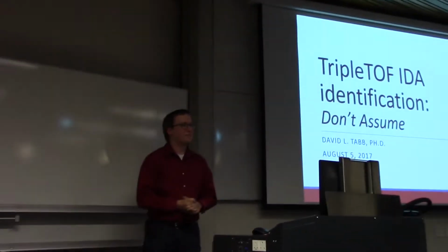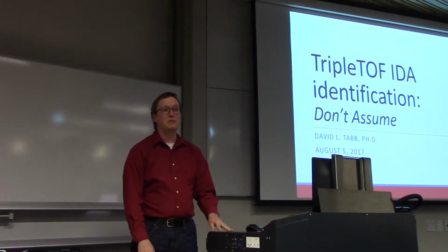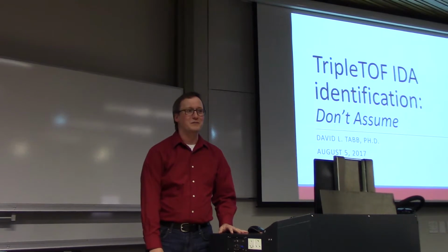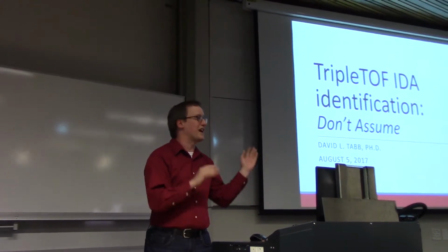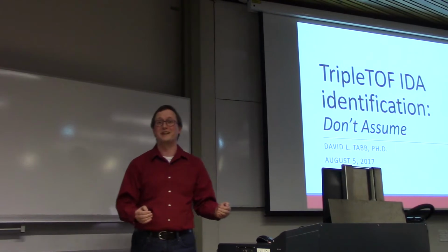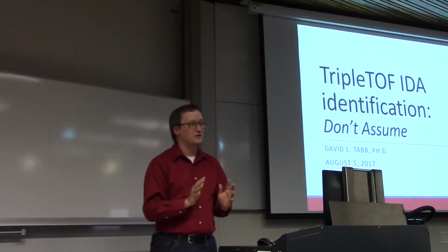Great. Well, hi everyone. I'm Dave Tabb from over at Stellenbosch. I am really glad to talk to you about the problems of identifying spectra that we collect on these brand new TripleTOF instruments. Now, the TripleTOF is exciting. Even if it had exactly the same capabilities of the Q-Exactive and we could just run twice as many samples every day, we would already be pretty excited about that. But in fact, it does offer some new kinds of challenges with it.